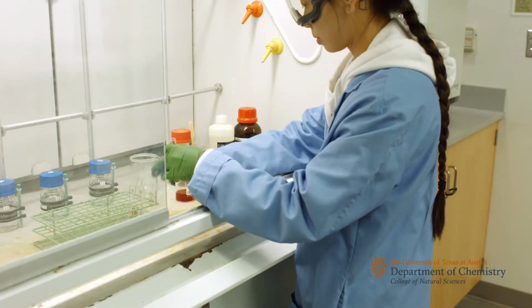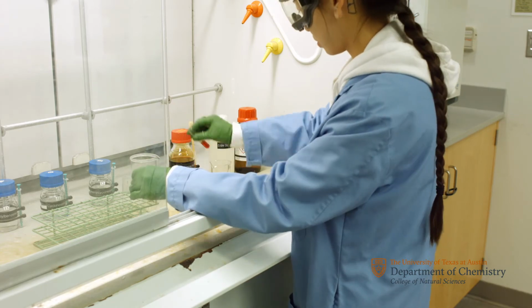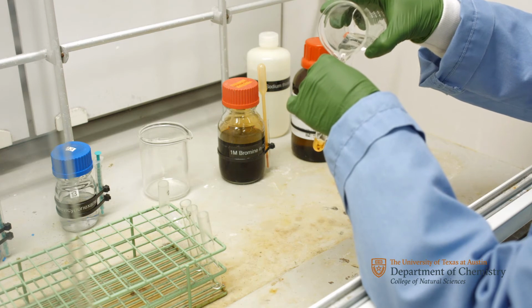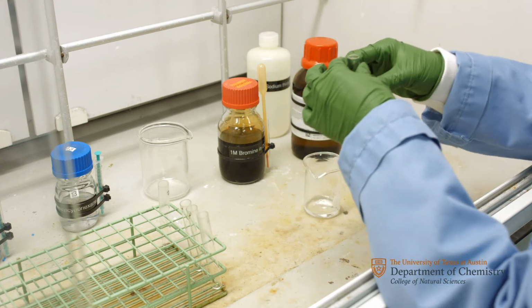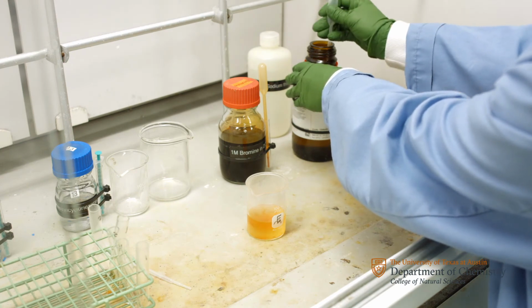To clean up, pour the contents of each test tube and any other waste into a beaker. Rinse each tube with a small amount of DCM and add that to the beaker. Then add a drop or 2 of cyclohexene to the beaker to remove any excess bromine.